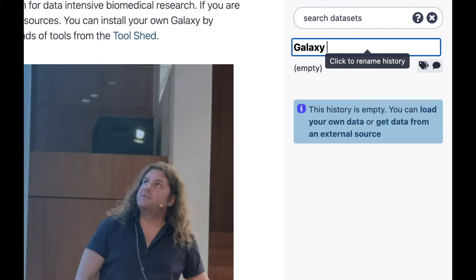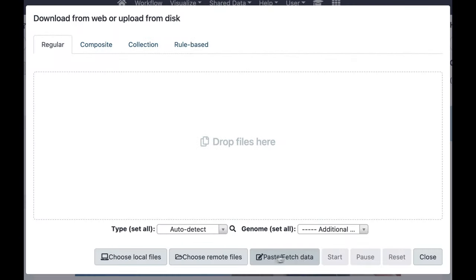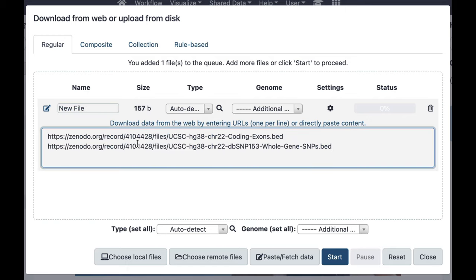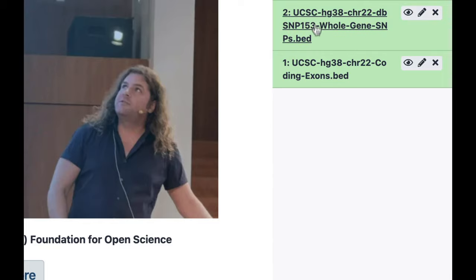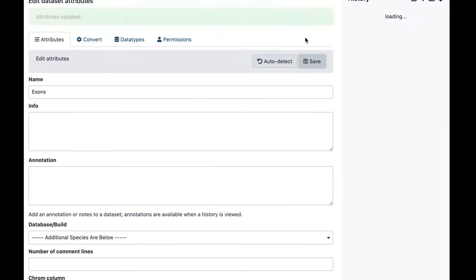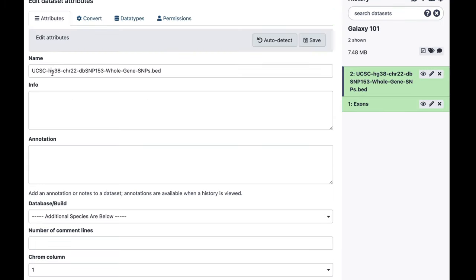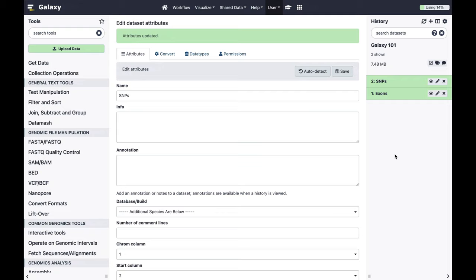This is an empty history. I'm going to call it Galaxy 101. I'm going to upload data by pasting two URLs from the tutorial and click start. This will create two new datasets in the history. You can expand datasets to see what's inside. I'm going to rename them with more descriptive names — I'll call this one 'exons' and this one 'snips'.